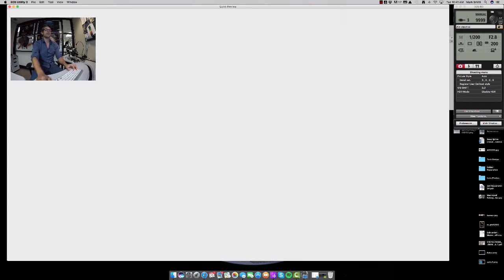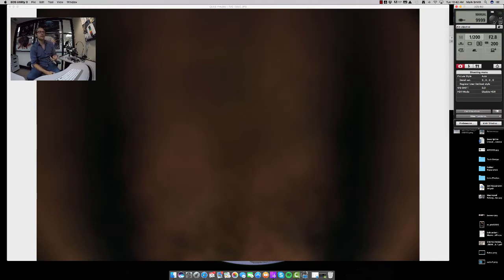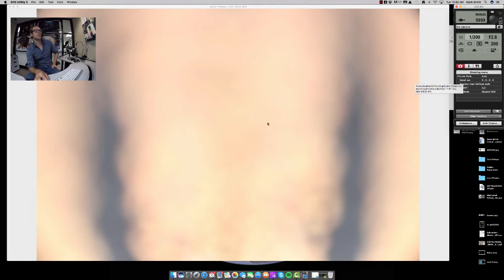I've got my quick preview window open now. I'm just going to take a test shot and take a look at it. I can see my contrast is really good — the black areas are really black, and the areas where there's a lot of color in the scales is really even, and there's not a lot of glare. Now if this was a little under-bright, I'll take this back up to 1/32 — you can see how dark that is. You get a little bit of color coming back but not much. That's generally an example of when your lighting is not bright enough. And now going the other direction at 1/2: the dark areas are still dark, however, you can see how a lot of the colorful areas are almost becoming bright yellow, bright orange, bright white — the image looks washed out, and that's an indication you're too bright. So we're just going to take the flash back down to 1/8, which we know is a pretty good setting.